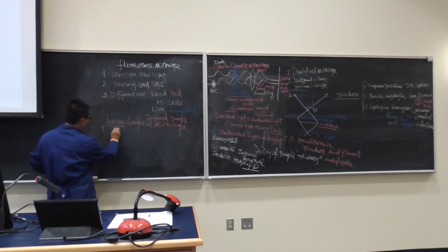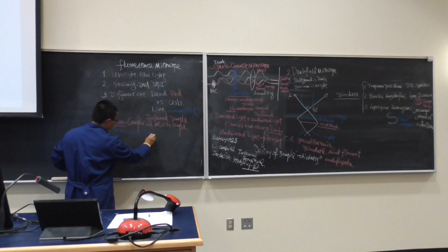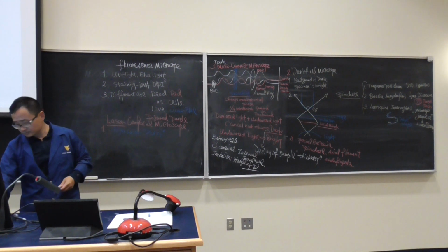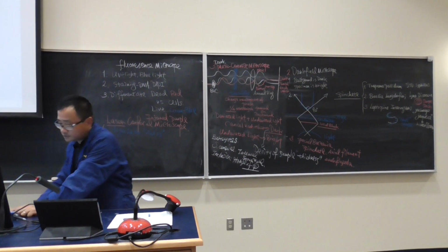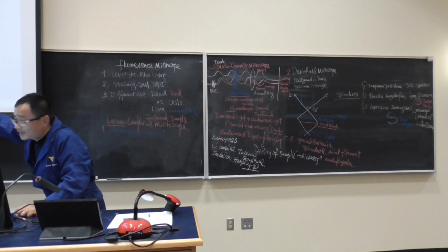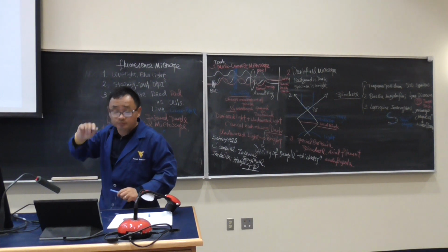Most of the time, what they use commercially is called argon laser. They come from a company called Zeiss. Now, where is it? A big image company, courtesy of Zeiss micro imaging. Look at that, ZEISS. That's a big company to generate all this equipment, yes?